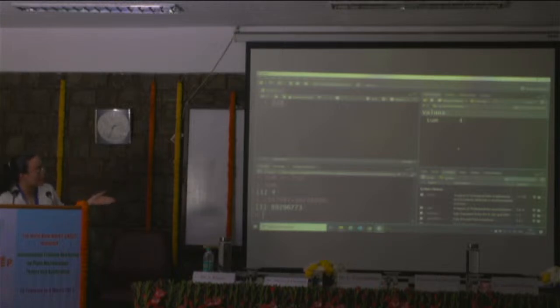You're going to have the name on the left. There is a little white box. When that white box is checked, it's because you already loaded that package. So it's not only installed, but it's loaded. Those are two different things. You can install a package. That means you retrieve all the data from it. And when you load it, you make it available for use in your current R session.